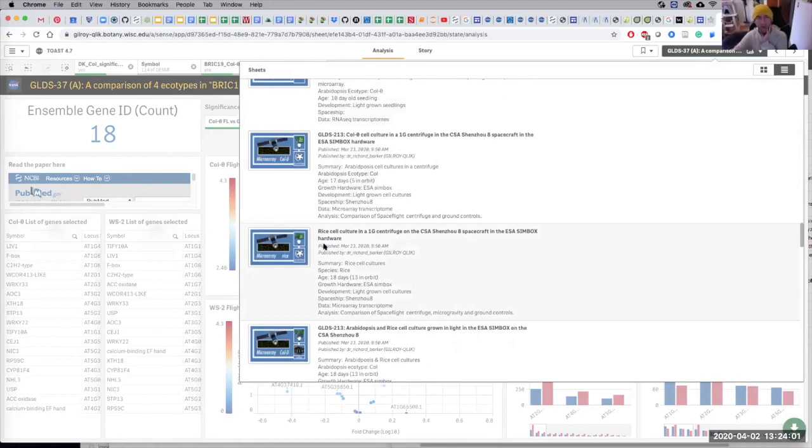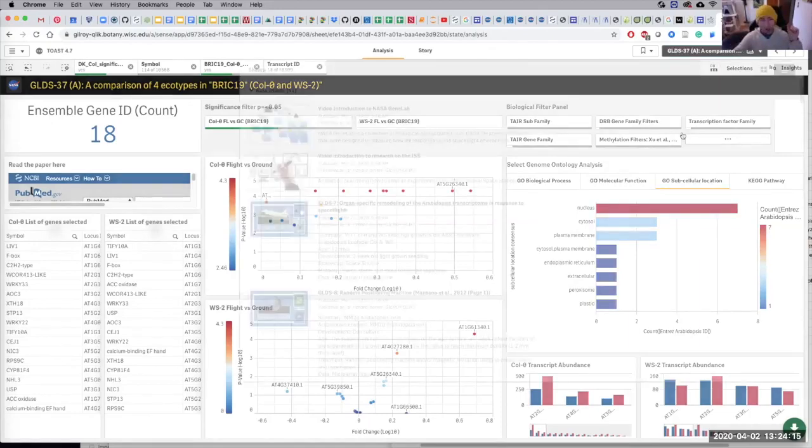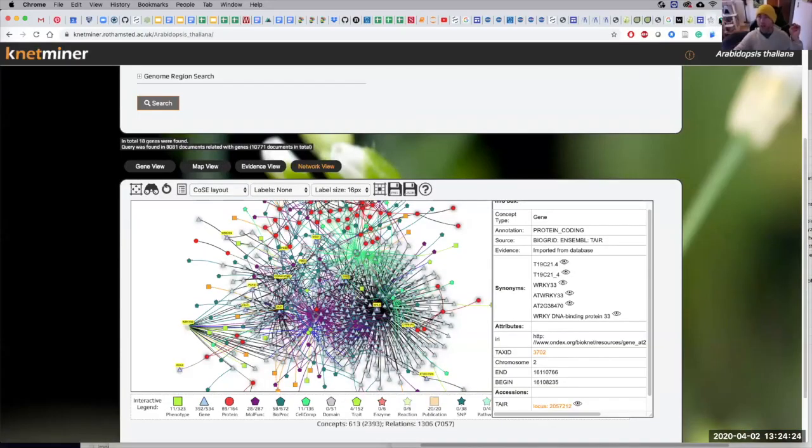So we compared this study to this study and applied the mitochondrial subcellular localization filter, and that was the research paper. But as you can see in this software, we have a lot more data sets. There are so many patterns in here and so many stories to find. And this is literally how you do it. It's really not that difficult.